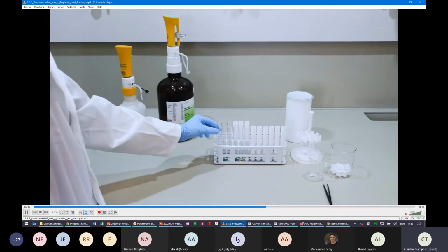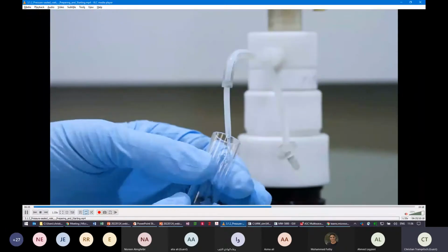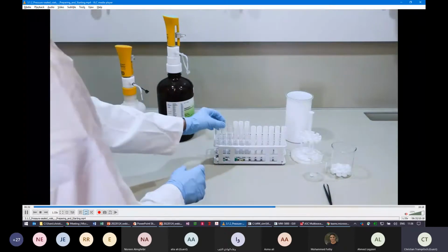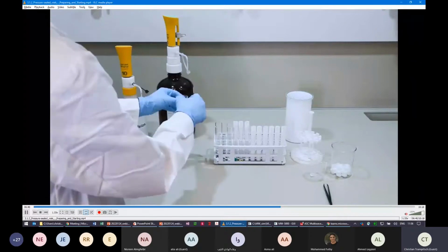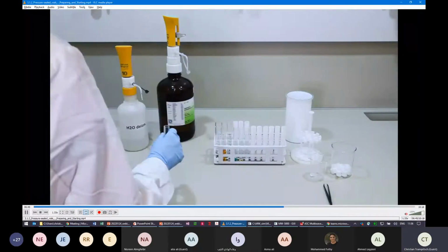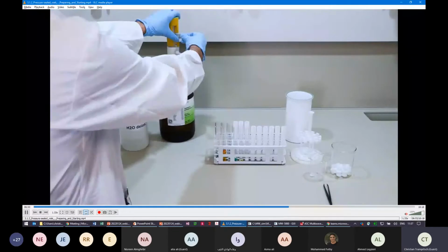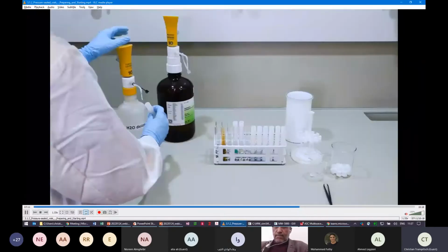Then we add the acid. What we also like to use sometimes is a small amount of water. That's a general hint, but here we've seen how efficiently it works. A small amount of water can drastically decrease the reactivity of a sample during the run. So when you have to bother with very reactive samples, consider the addition of a small amount of water, maybe 1 ml, maybe 2 ml, and so the reactivity of the acid will not be that high, and the run will be much smoother and much safer.